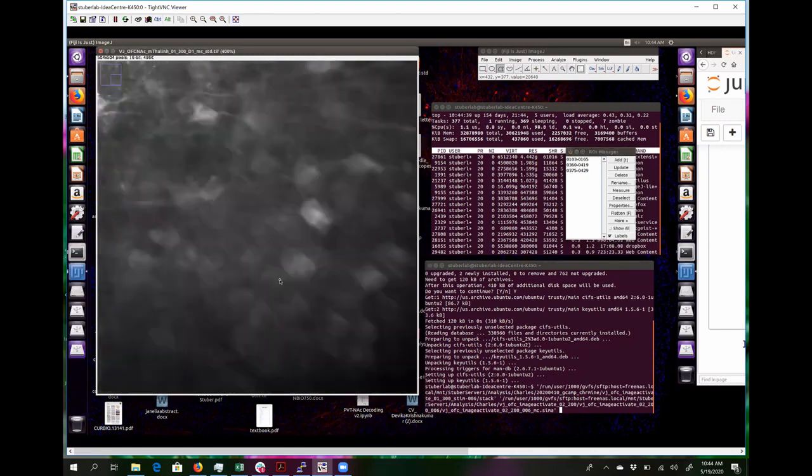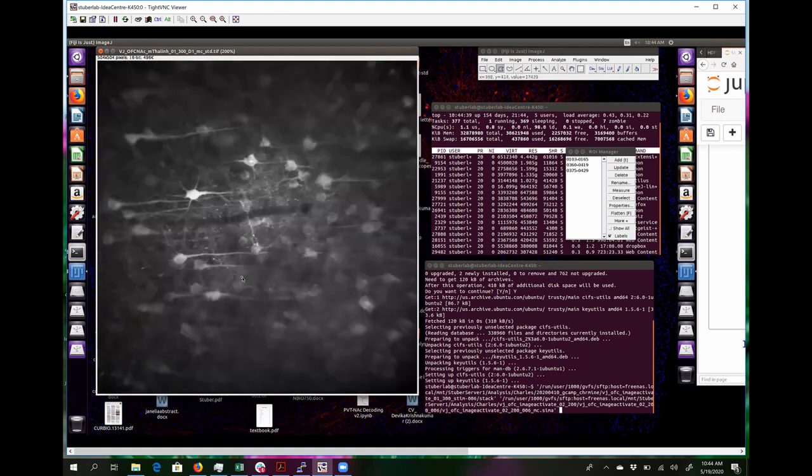The key here is to keep in mind the limitations of the recording. Keep in mind what your final output should be. What do you want to study from it? Remember that the most important point, not just for this, but for literally every single processing step, analysis step, is this: the final conclusions that you make in your paper are not, oh, this cell has this much activity here.